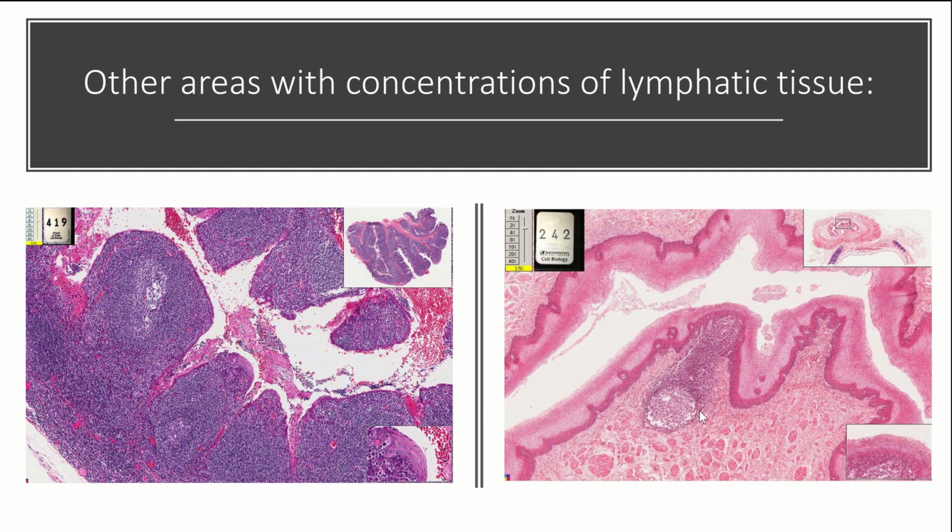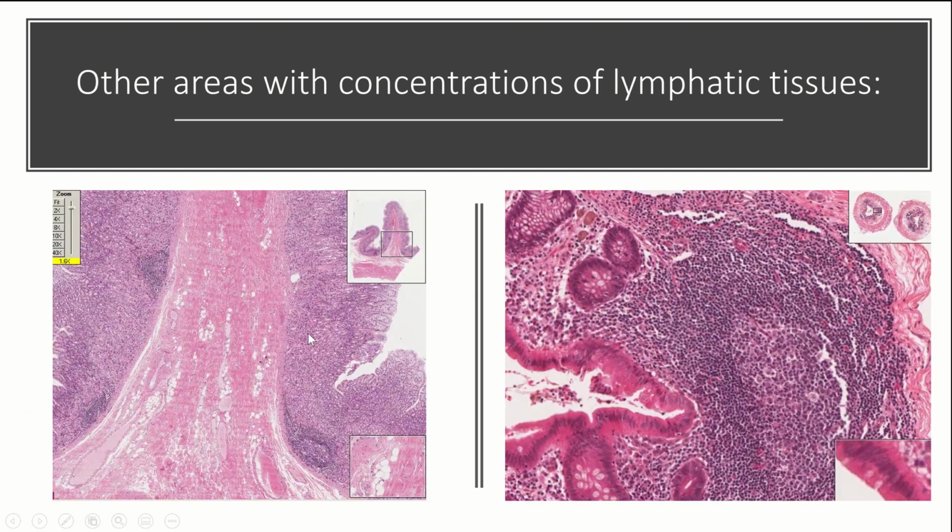This one right here, this is in the esophagus, right? Because remember, you're still eating things, you're eating germs. So in the esophagus, we also have follicles where we have a high concentration of white blood cells. And they're again hoping that if you are going to eat a germ, they can come in contact with it and know what's coming before it gets to your intestines and stuff like that and actually causes a problem. Okay, so they're just kind of trying to pick up on these germs early so they can start hosting their immune response.